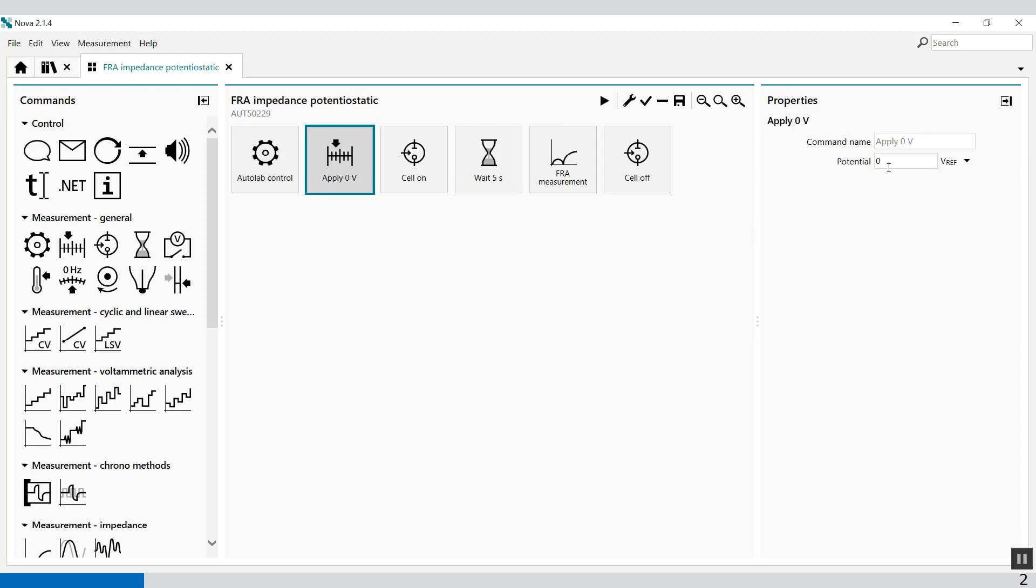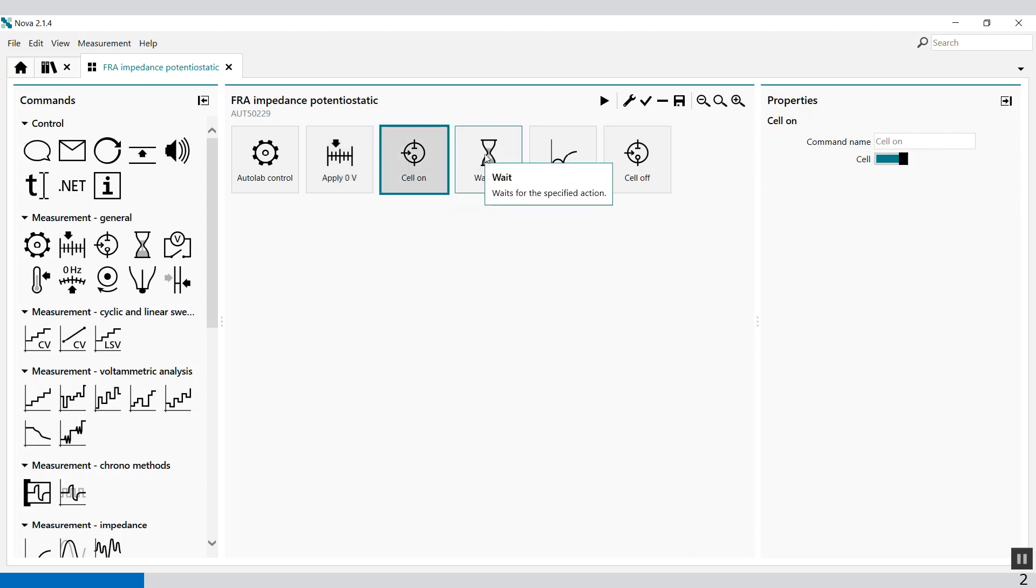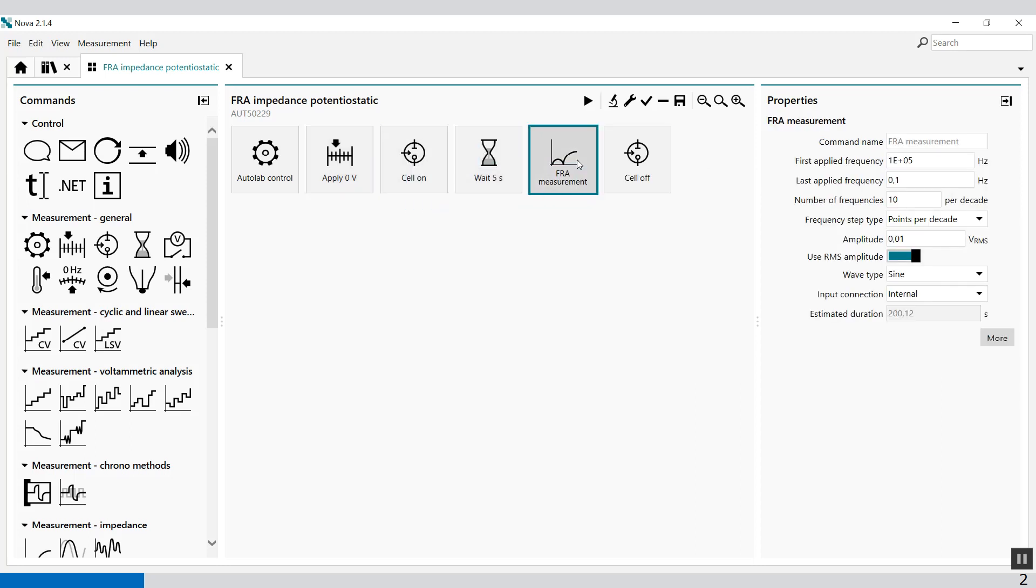We apply 0V with respect to a reference electrode, switch the cell on, wait for 5 seconds, and then we do an impedance measurement or FRA measurement.